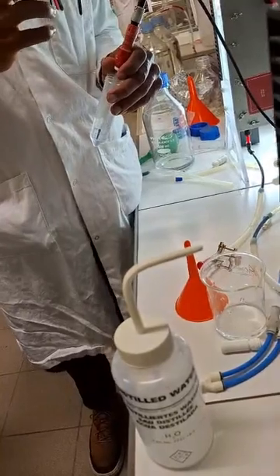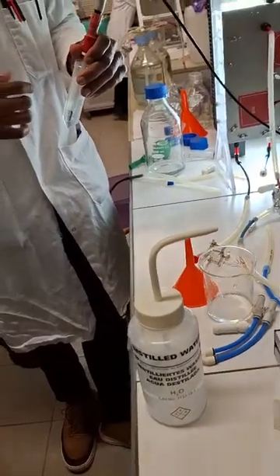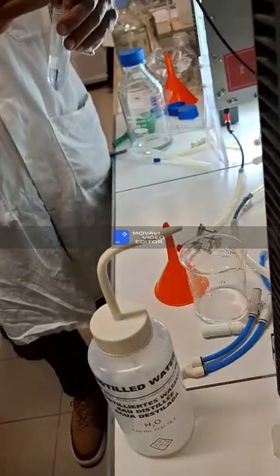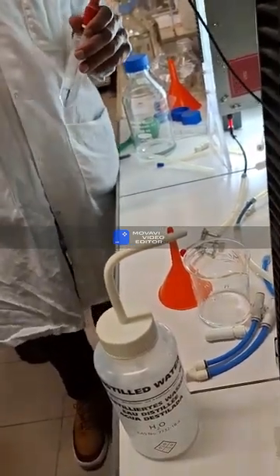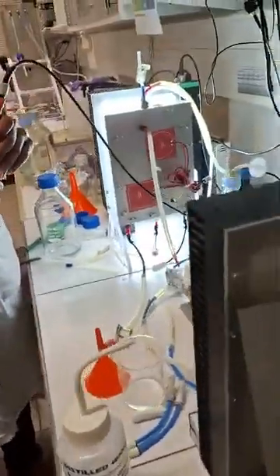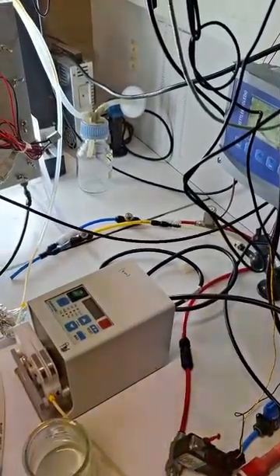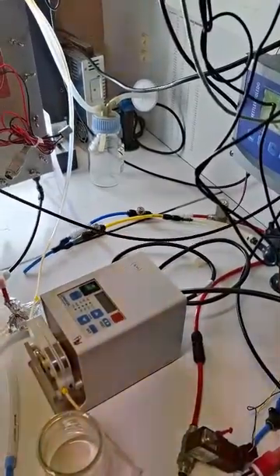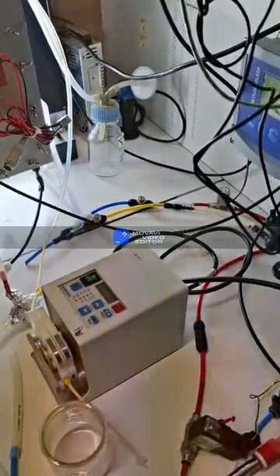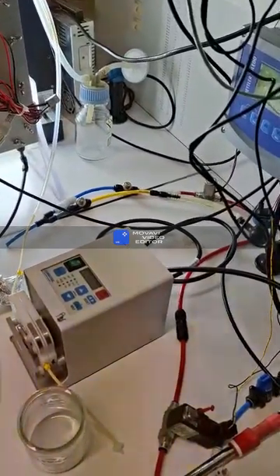That's not my question. My question is why we need additional calibration to like 4.9? Oh, because it can change. You have to verify everything before you launch the culture. Always. Because, for example, if your probe has a problem, and you don't calibrate, for a pH of 4 you have 7. So imagine that when you will reach a real 7, you will be at 10, for example.